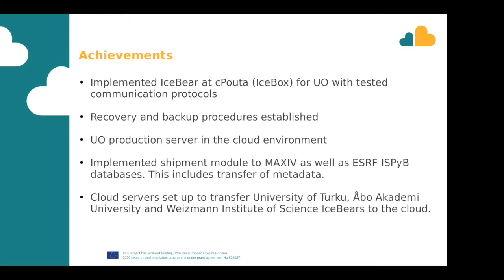And we have also already set up cloud servers to transfer the IceBear instances within Finland and also within the Weizmann Institute to now put that cloud environment to real use. There's some complications there naturally, because there's some not very modern imaging systems and different databases running those and different structures. So we have to make a bit of prioritization of where to put the resources and not to develop anything for the obsolete instruments and so on.